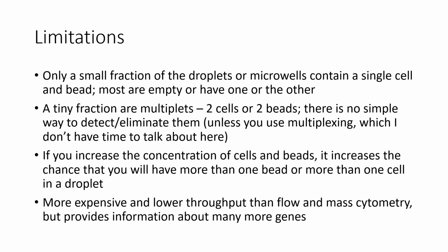The process has some limitations. One of the biggest has to do with sorting particles and cells into compartments. Only a small fraction of the droplets or microwells contain a single cell and bead. Most are empty or have only one or the other.